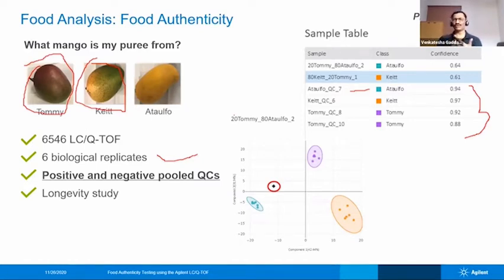For example, carbon has C12 as well as C13, and the ratio varies. Nitrogen has N14 and then 15, but if you look at some halogenated compounds, chlorine has 35, but it doesn't have 36.